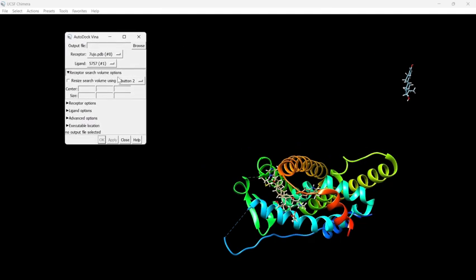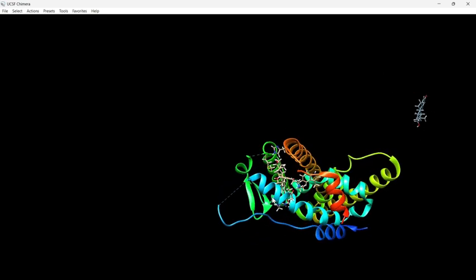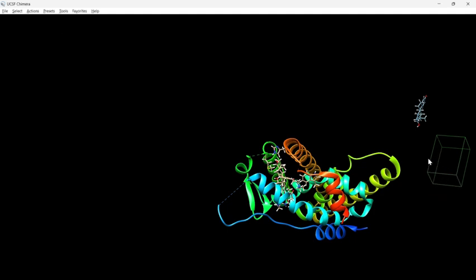You definitely need to draw a grid box over the position of the ligand here. Just draw that. Just simply enter any number, so you can get a grid box over here. It's going with 10. Okay. Then once you press the control button, you can resize it by clicking control. I'm showing it like this. You can just move it to the ligand.